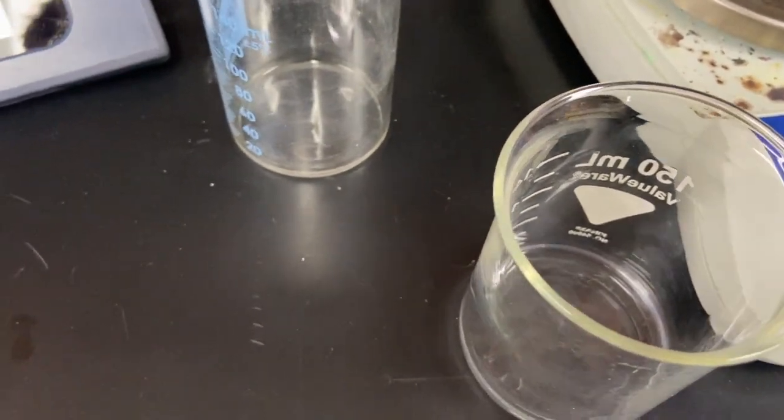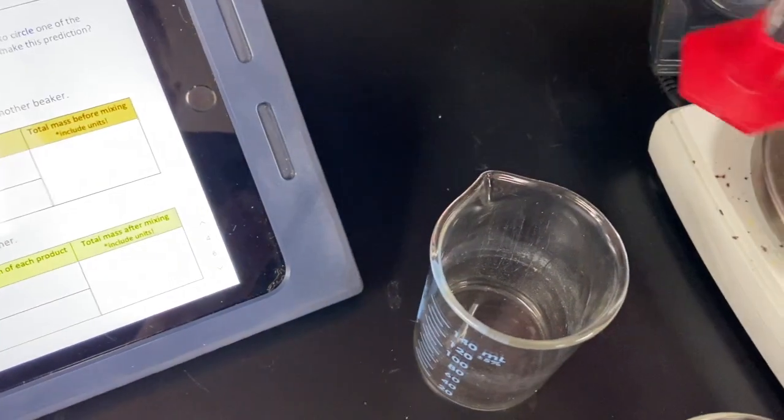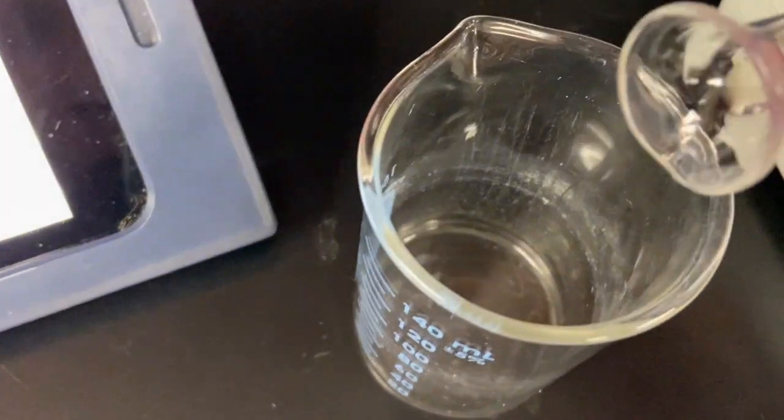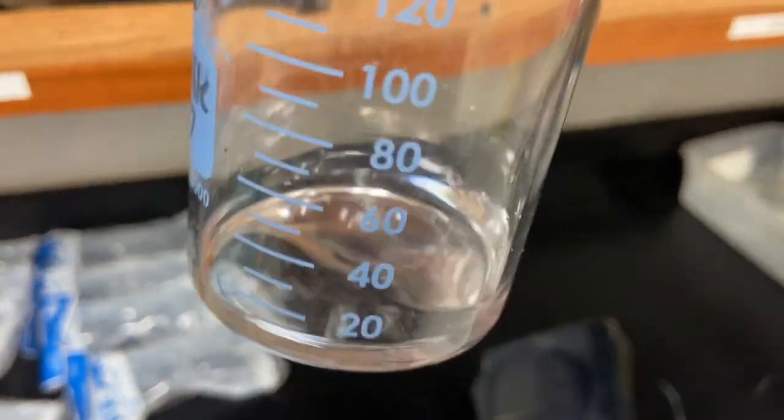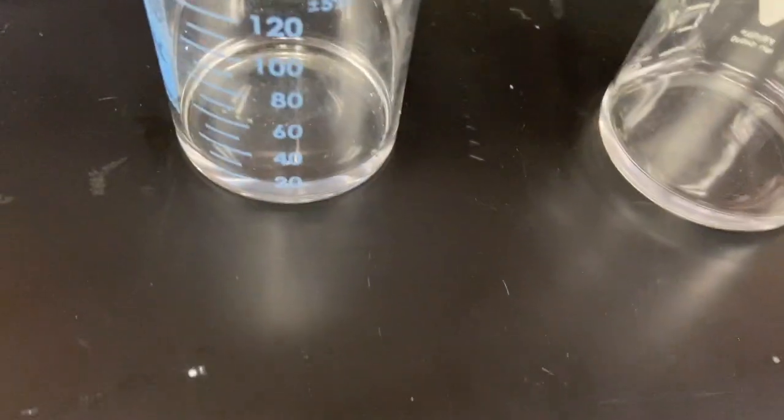All right, so we have the sodium carbonate right here. Next we have the calcium chloride right here. So you can tell they both have a similar appearance.